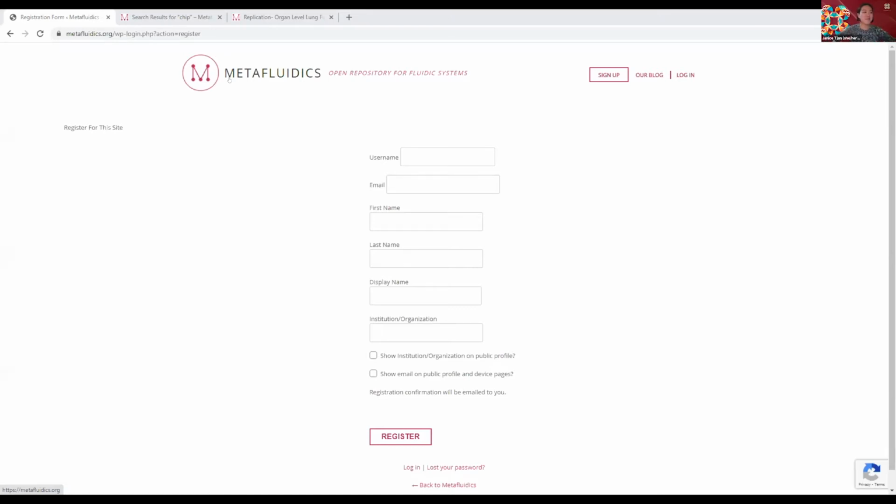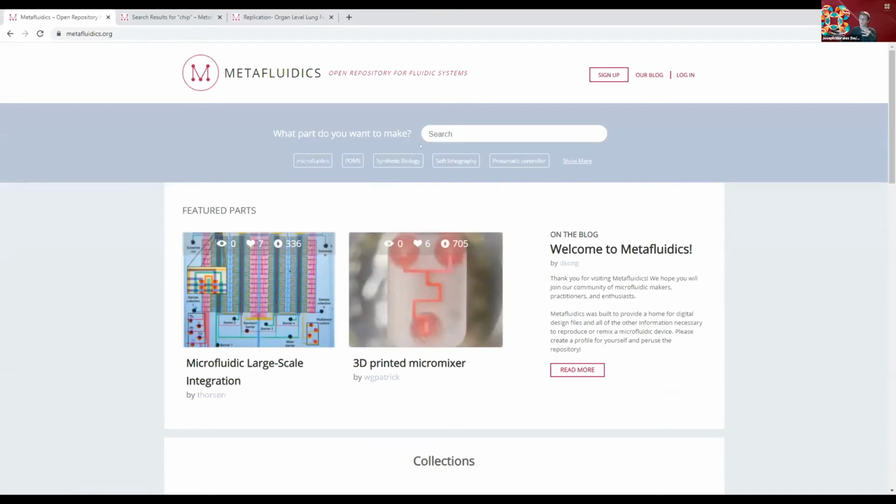Oh yeah, and to address a question that was brought up in the chat earlier, somebody talked about surface tension. How are we supposed to deal with the fluids? We do want surface tension when we work with microfluidic devices because it allows for really interesting behaviors. For example, if you have blue dye and red dye and you feed them into the same channel, they won't mix until you start making these serpentine channels. So you can get these really cool situations where you have multiple substances next to each other and they aren't mixing, but they're still going through the same channels. That's just an example of how microfluidics takes advantage of the small scale.